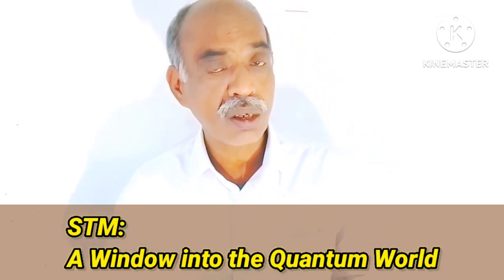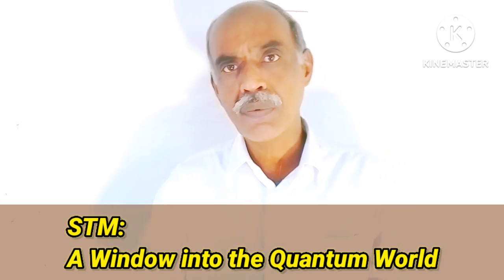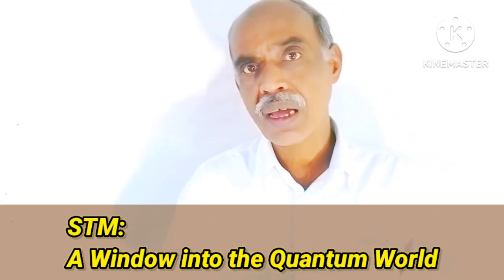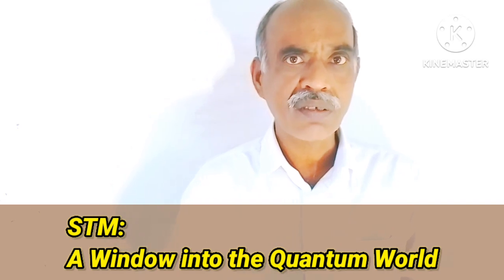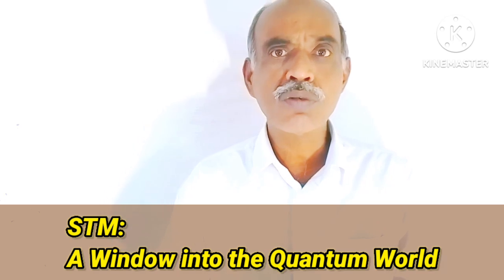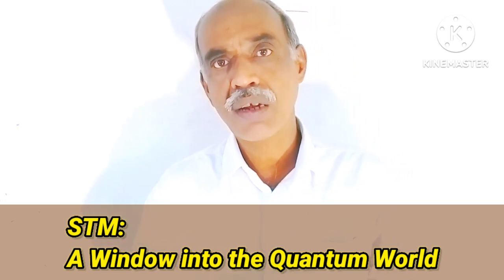So what you need to do is move the metal tip across the surface, and depending upon the position of the atoms, the currents will be different. By noticing those different currents, we are able to reconstruct the required image of the atoms.